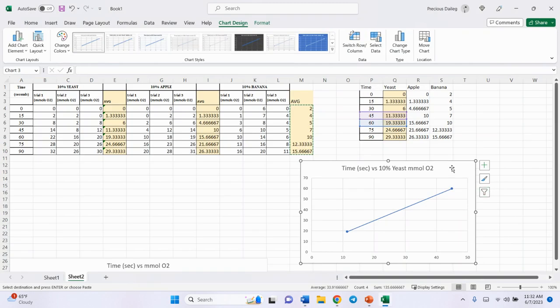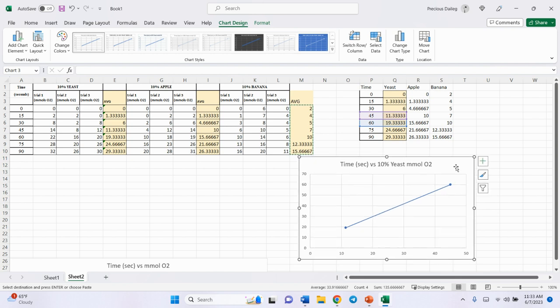So this next part, if you are not on the Excel program, like let's say you're on Google Sheets or you are on the OneDrive version of Excel, depending on that version, sometimes it doesn't show up, sometimes it does, right? It should be the same buttons though, so try it out if you can find it. If you can't find it, then let me know. I can try to find it for you, or just download the Excel program on your computer. It's free for you guys because you guys are students.